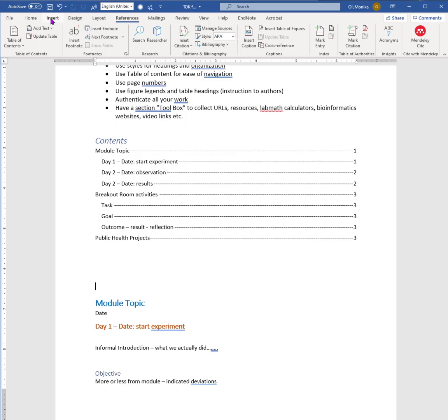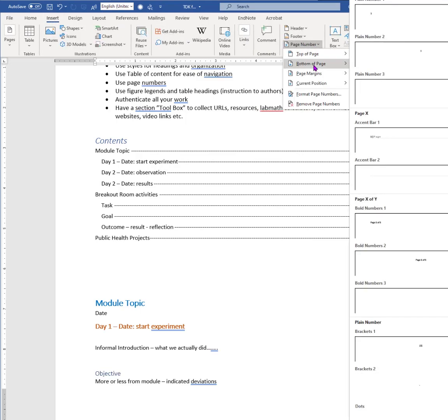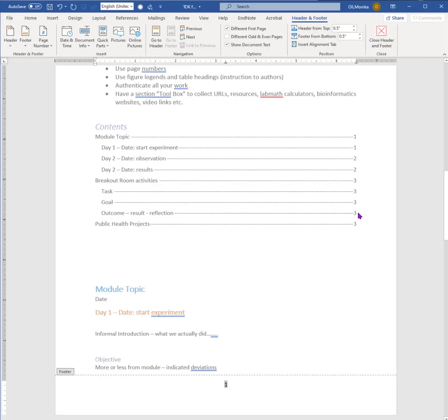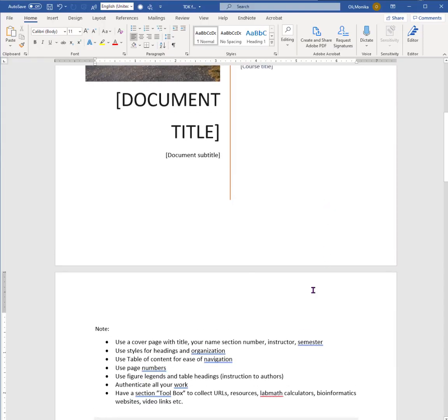You definitely want to also have page numbers, so you go to Insert and then you go to Page Numbers, and where you put them is entirely up to you. I usually put it bottom center, and then you say Close.